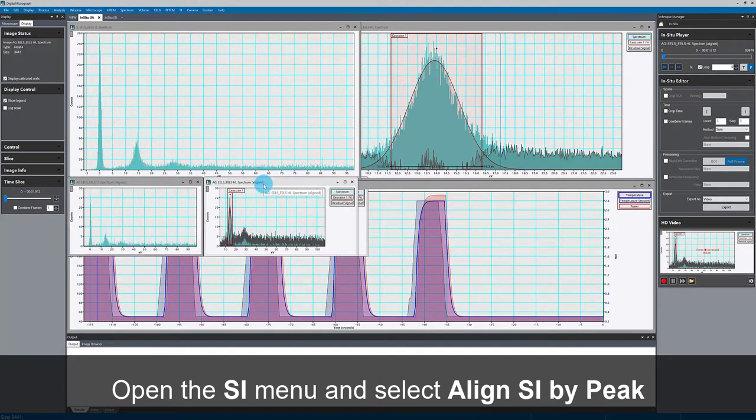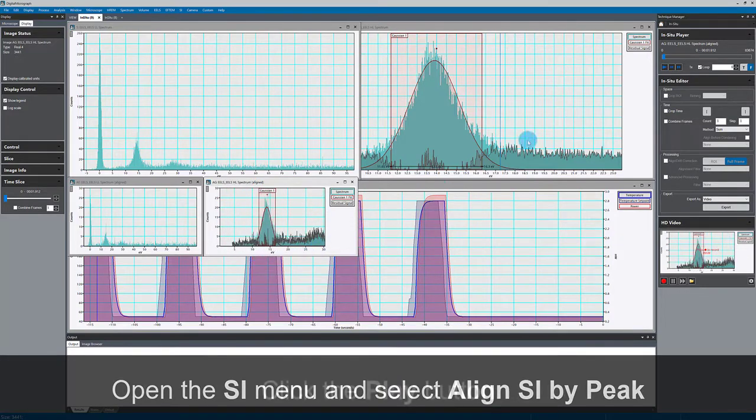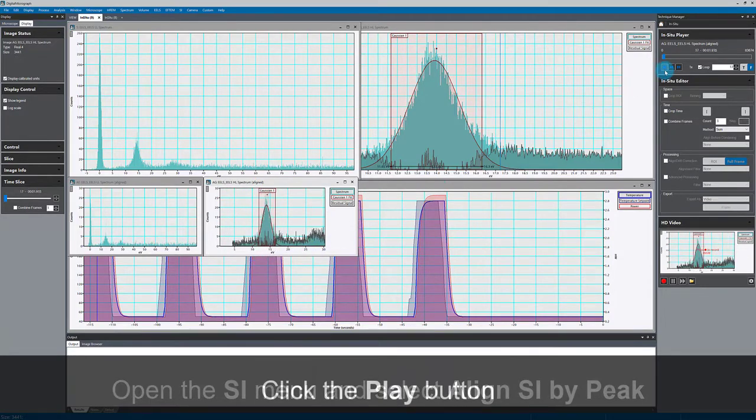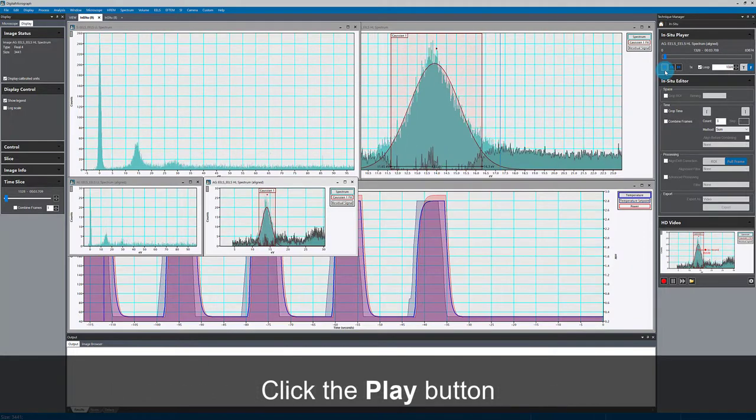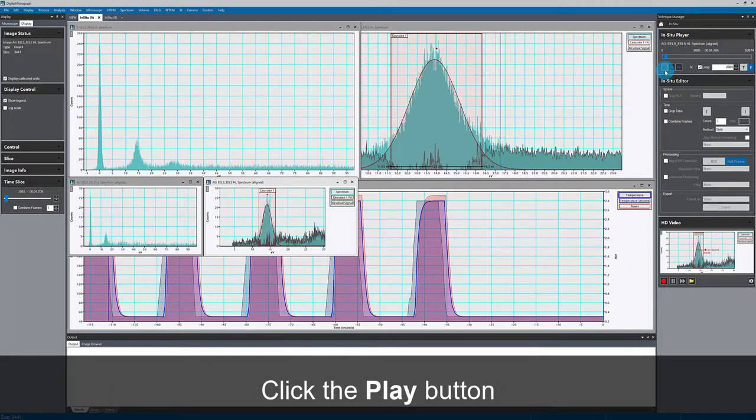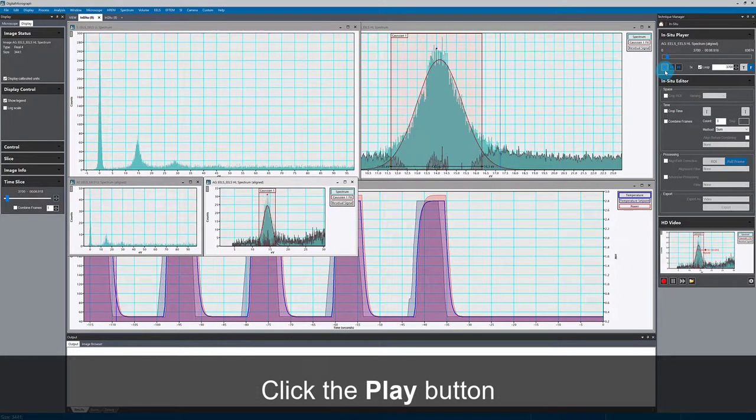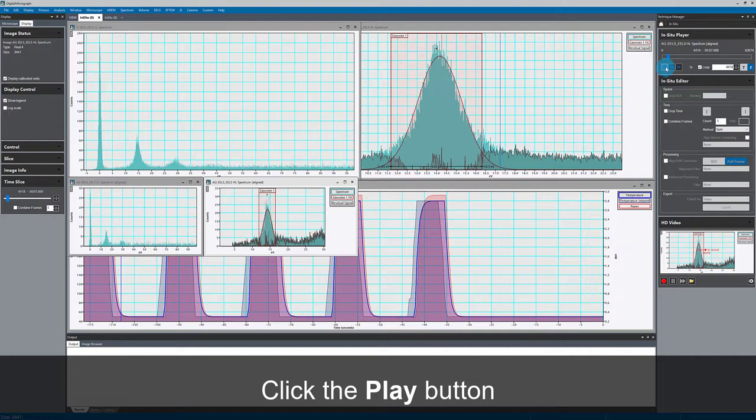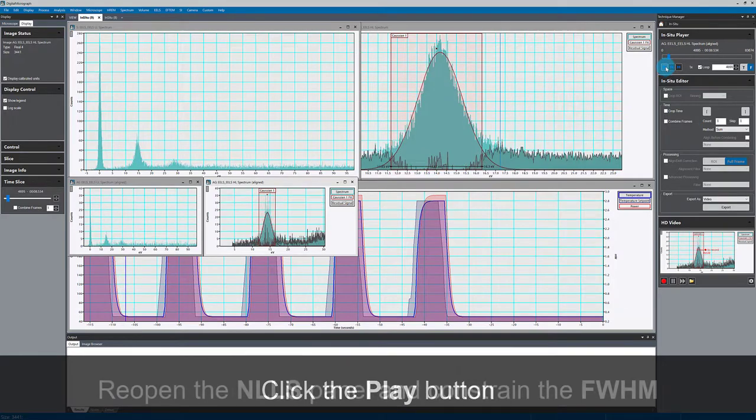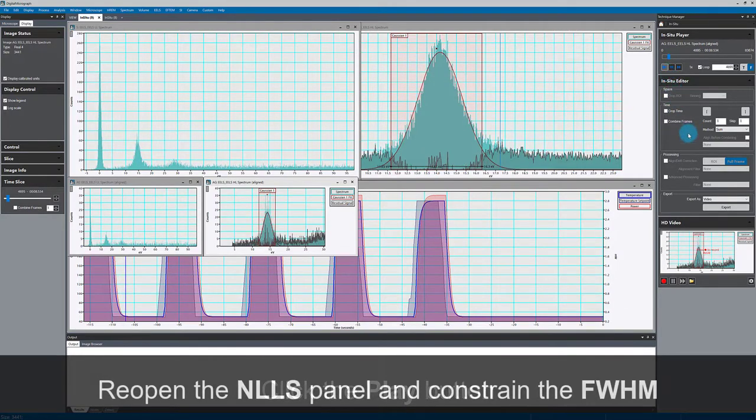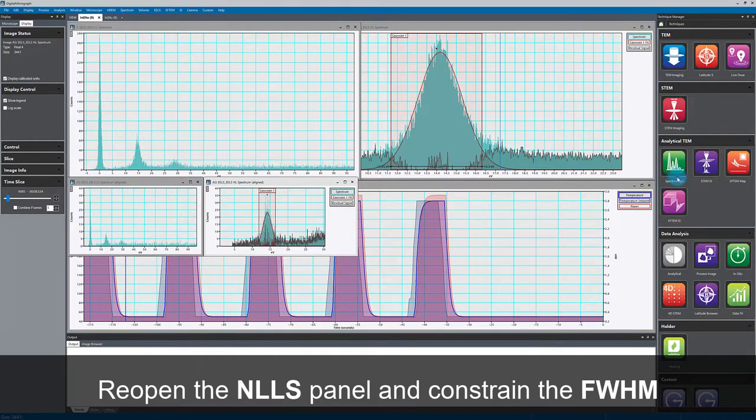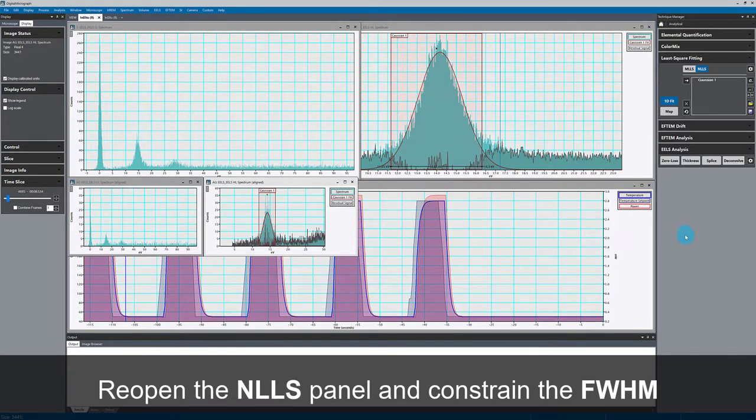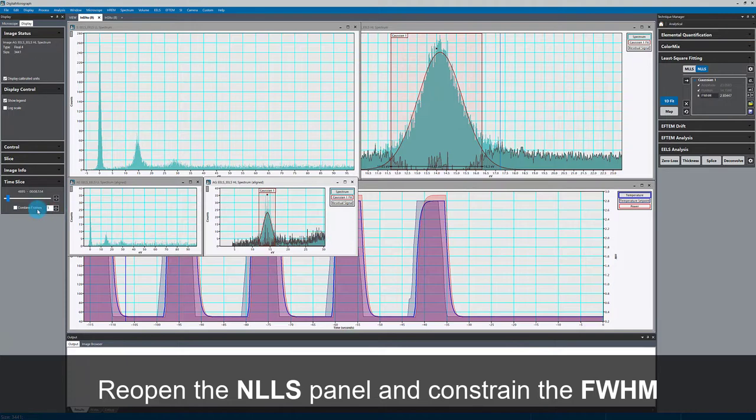Here in the aligned data, I still have my fit and I can play that back. So now you see both the aligned data and the original data are playing back synchronized using the IS player. I'll constrain the full width half max of this peak since I don't expect that to change.